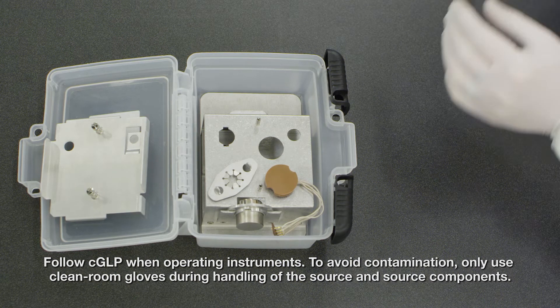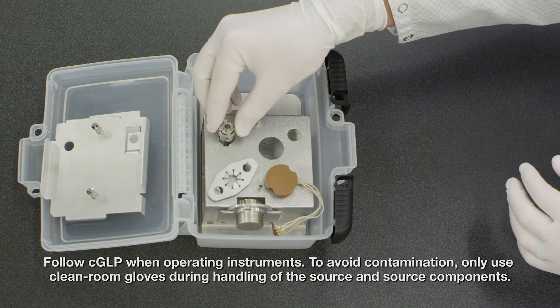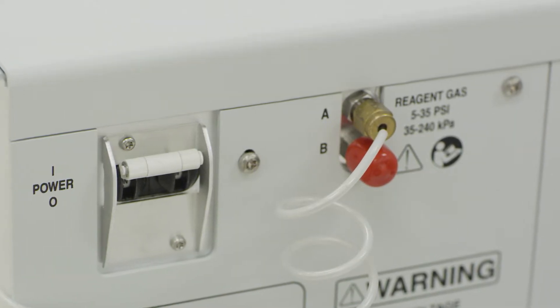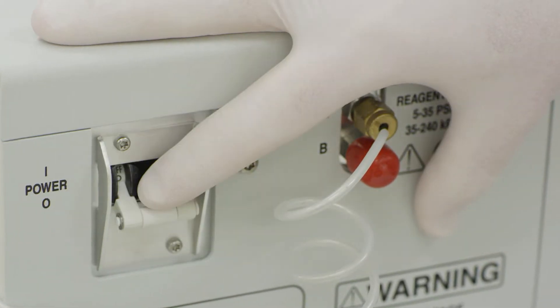Place the EI source into the designated location in the source box. Shut the system down and turn the power off following the instructions in the user guide.